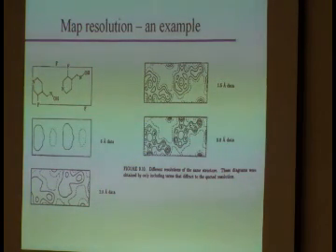Actually, I don't really know because we didn't look at it. It probably doesn't scatter quite as far as 0.8. Okay, it was a very small crystal. So that happens. You can probably do something with the data, but in an ideal world, you want this really high resolution data. Okay? So, that's your Fourier maps.